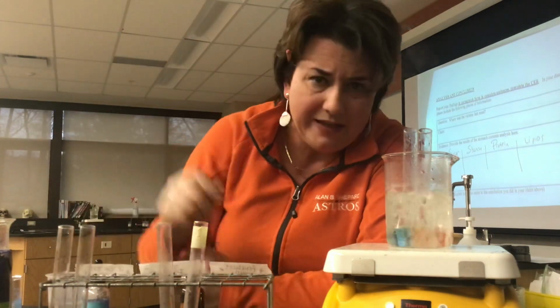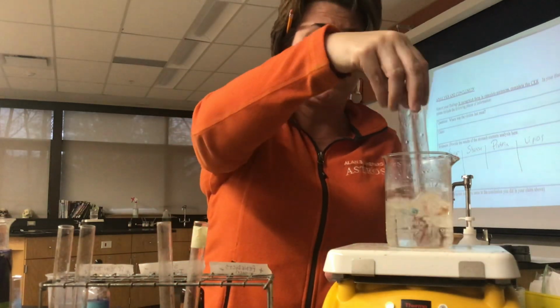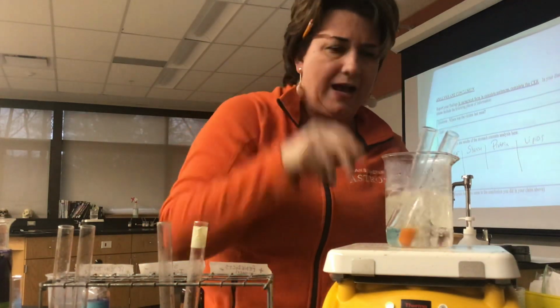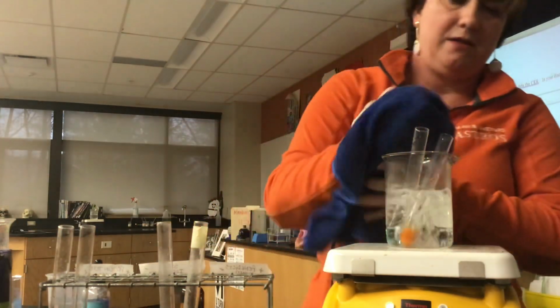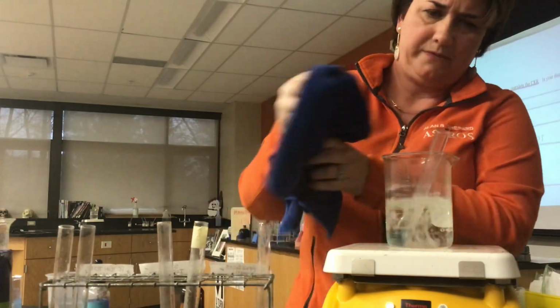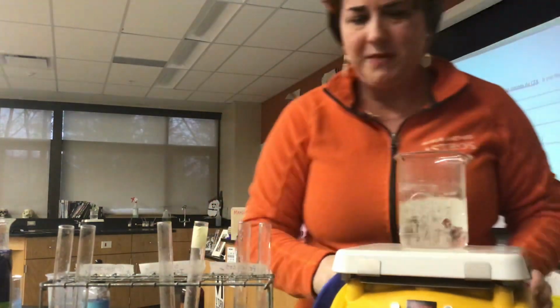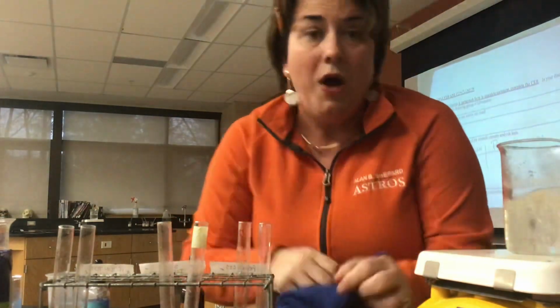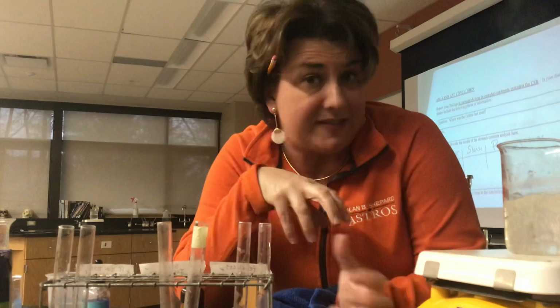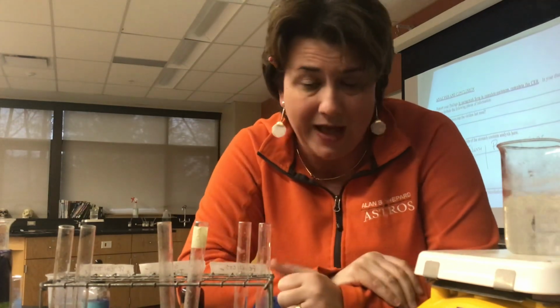Okay. All right, let's come back and just take a quick look at my Benedict's, which is my sugar. Ooh, those are pretty hot. Let me pull these out of here with my cloth. And I'll go ahead and turn my hot plate off as well. So what I was testing for was just simple sugars with that first test. That required a little bit of time on the hot plate.